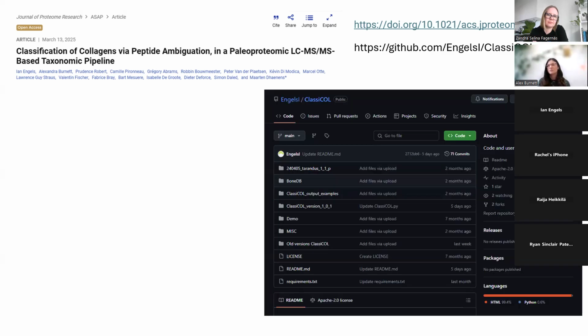You can find all of the materials for the ClassiCOL algorithm and for the IsoBlast algorithm on Ian's GitHub. So it just looks a bit like this. There's not too much on there, but we are constantly updating it. So we do suggest that you use the most up-to-date version.